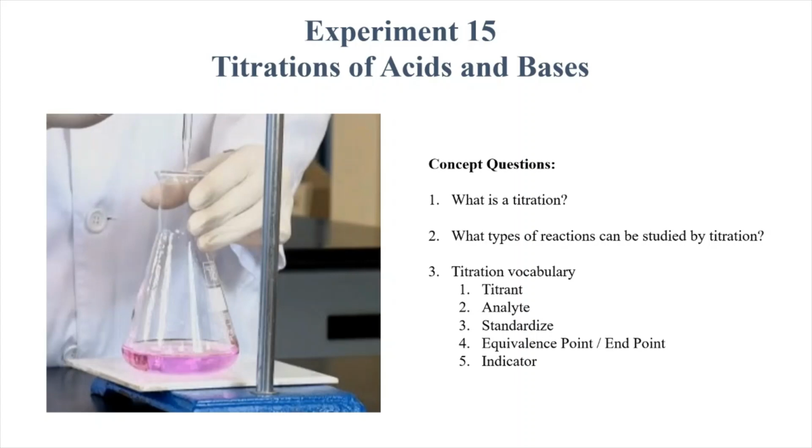So we're going to use our understanding of titrations. We're going to remind ourselves about some of the key aspects of what a titration is in the beginning of this presentation. And then we're going to look at how you actually set that up experimentally and accomplish a titration in the lab. So the first question is what is a titration?